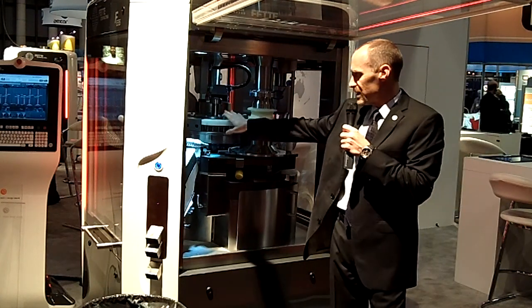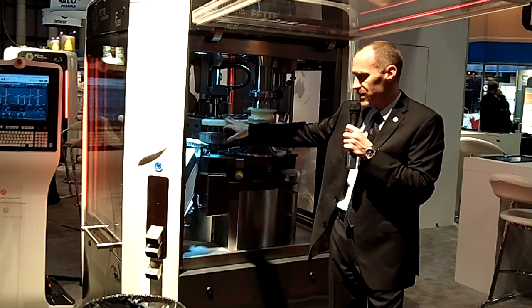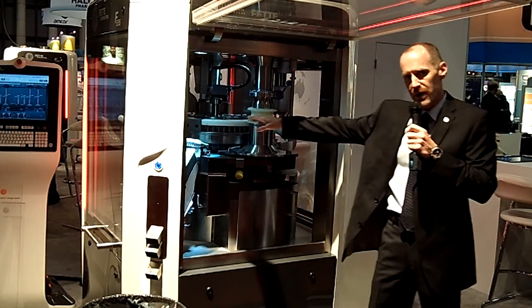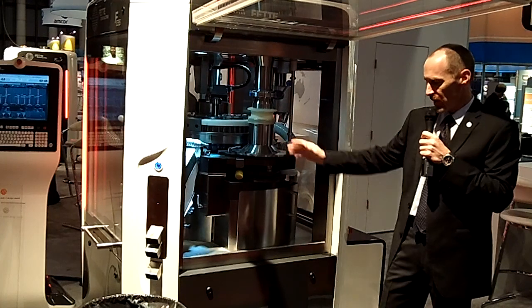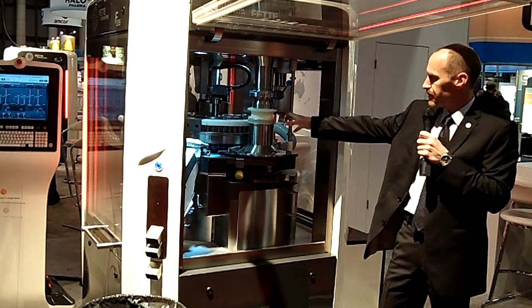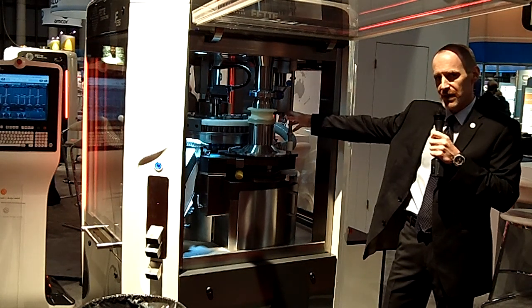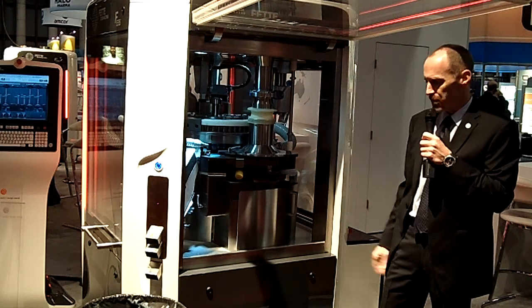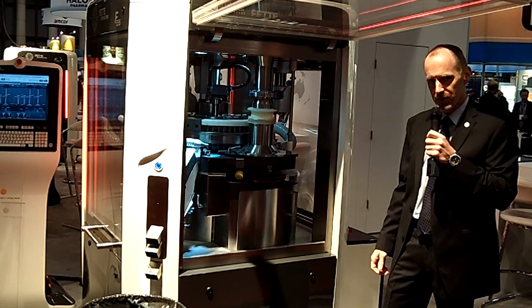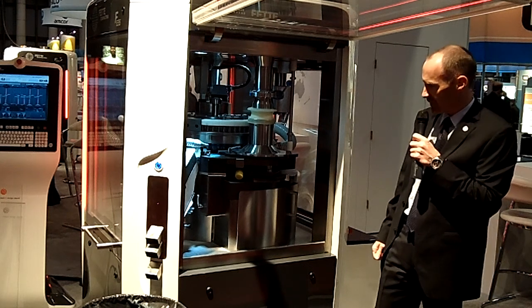One of the biggest innovations and one of the most important features that distinguish the FE55 is the fact that the turret is very large relative to the footprint. With a 550 millimeter pitch circle diameter, you can utilize up to a maximum of 87 stations on this press in only 1.6 meters squared of floor space. It's an unprecedented ratio for output to real estate.